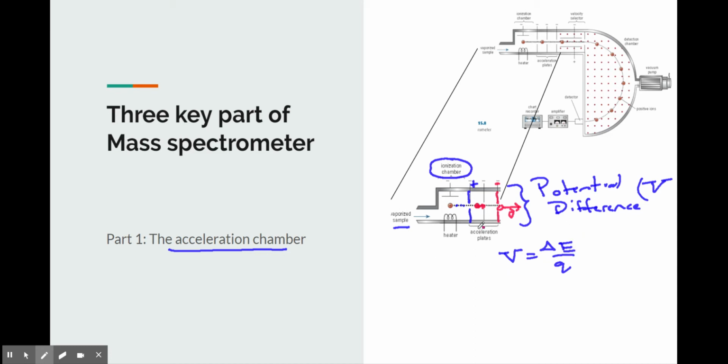So what I want you to pay attention to as I go through the theory here, without any numbers or examples, is just understand what's going on in each chamber. And so in this chamber, if we rearrange the formula, we're really talking about changing the energy of this charged particle by applying a voltage, and the amount of energy it gains depends on the voltage and the charge. And in the simplest case, we start with maybe zero velocity here, and we end up with some sort of a maximum velocity as it leaves this chamber.